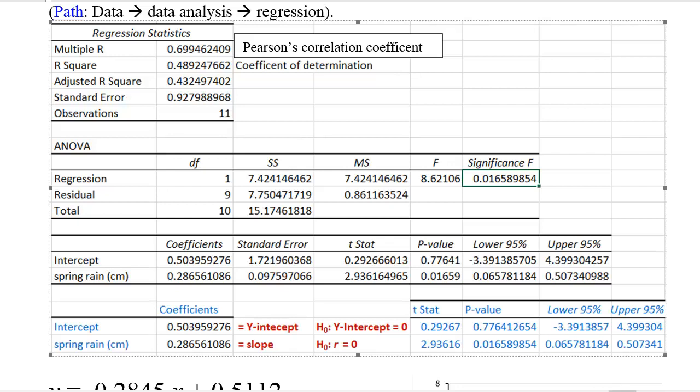The next thing we'd like to talk about is R squared. That is known as the coefficient of determination. That is the proportion of Y variation that is explained by the straight line. So what you do is you take Pearson's correlation coefficient and you square it. So in this example, the coefficient of determination is 0.489, so 48.9% of the Y variation is explained by a straight line.